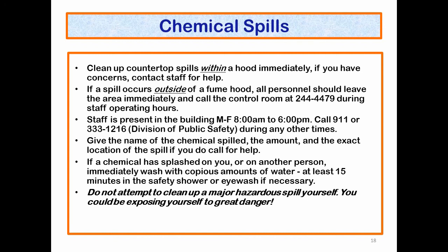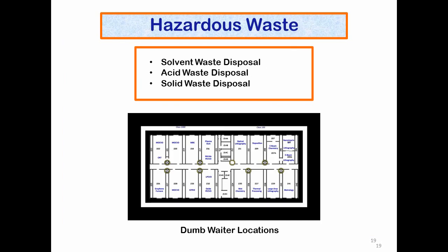Do not attempt to clean up a major hazardous spill by yourself. Always get help. You could be exposing yourself to a greater danger.